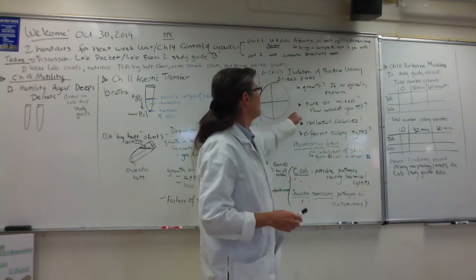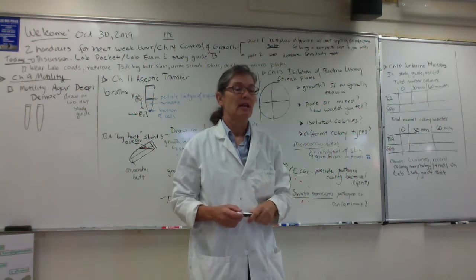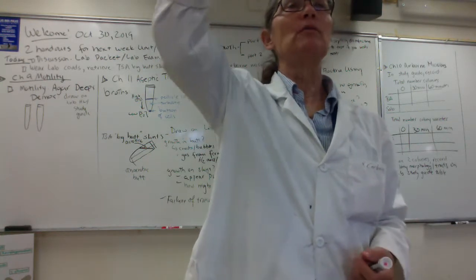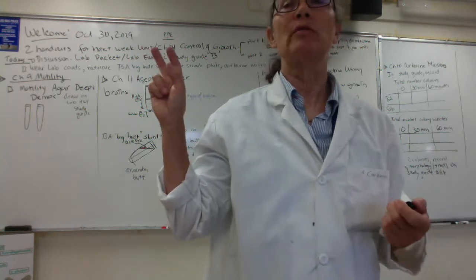Good. Okay, guys, so let's ask this. Do you think you have a pure culture from your urine, or is it a mixed culture? What I'm going to suggest, this can be tricky sometimes. Hold it up to the light and look at all 4 quadrants and see if you can detect only a single type of colony or if you think there's 2 or more different types of colonies.